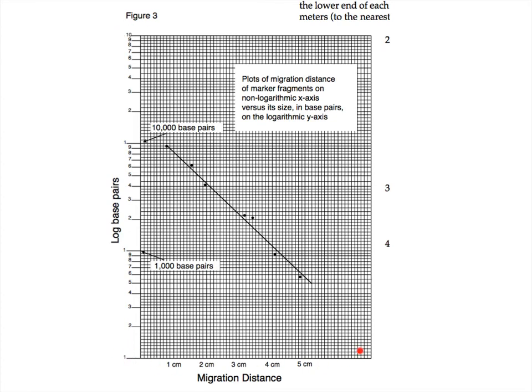On the x-axis, it really depends on if you're using centimeters or millimeters. Just make sure that you use your whole space so that your graph is not really tiny. Use up the whole paper so that you get a nice big amount of room to plot your data.